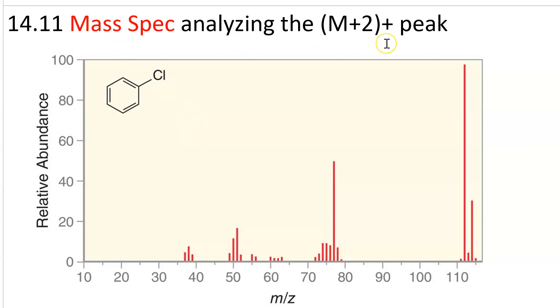Mass spectrometry analyzing the M plus 2 peak. Say you get a spectrum like this, chlorobenzene. We have our molecular ion peak at 112, and we have an M plus 1 peak at 113. But we also have a pretty abundant peak at 114. So we've got an M, an M plus 1, and an M plus 2 peak.